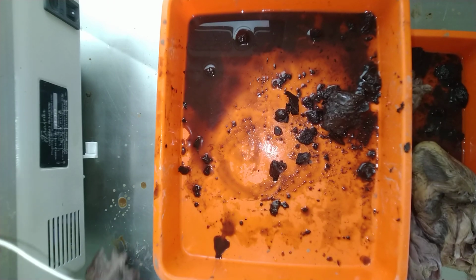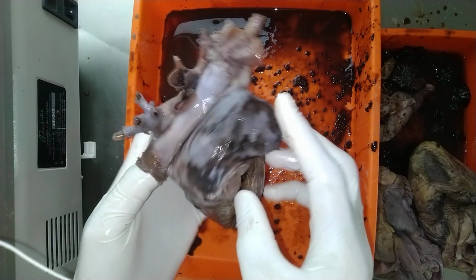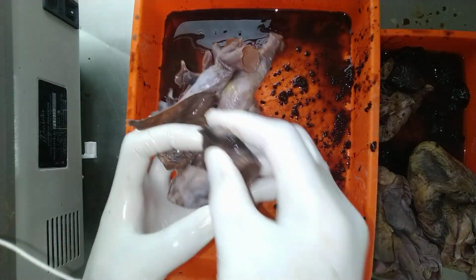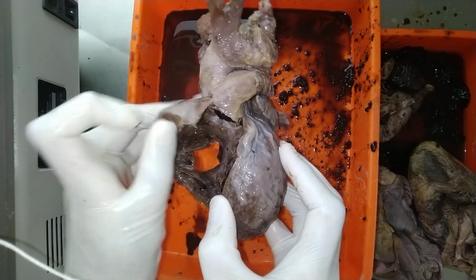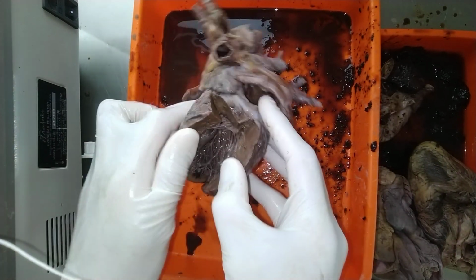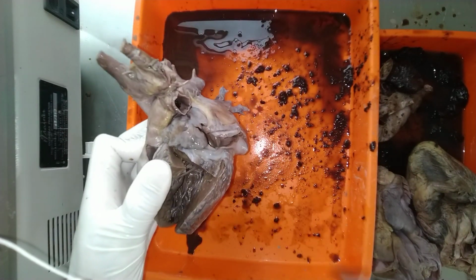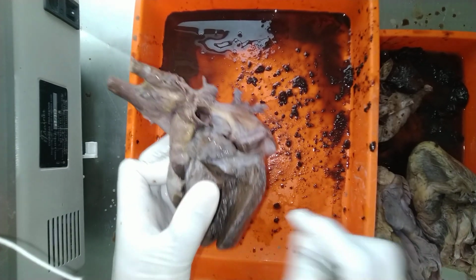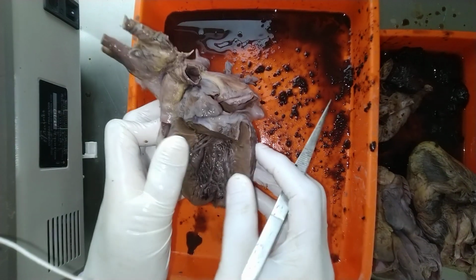I washed the heart again. So now it's actually very clean. So the chamber we were discussing is the left ventricle. This is the left ventricle. So I've opened up the left ventricle. See, the left ventricle is actually a small chamber, but its wall is thick. That is why it seems small, and it's very hard.